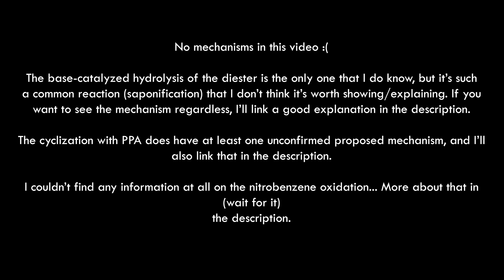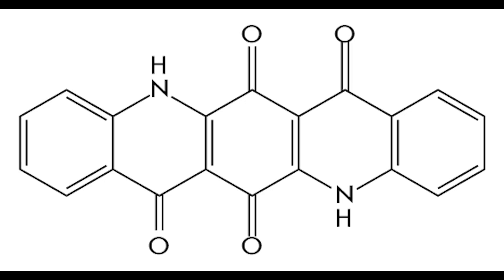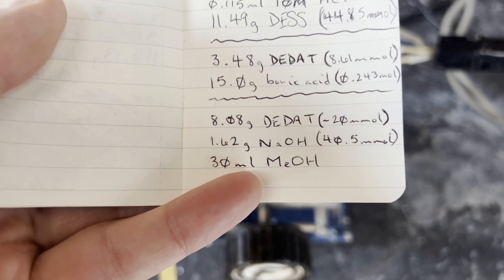Welcome back, y'all. In this video, I will, at long last, make quinacridone. This isn't the last video in the series, as I still have to make quinacridone-quinone from quinacridone, then figure out the best way to make quinacridone gold from them.